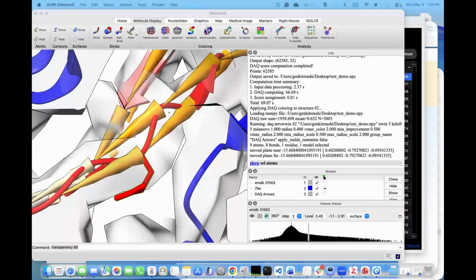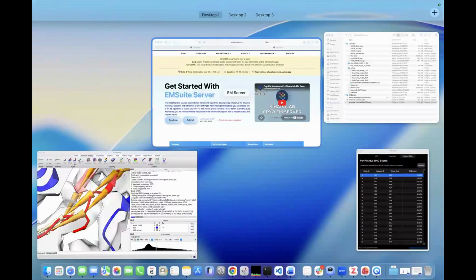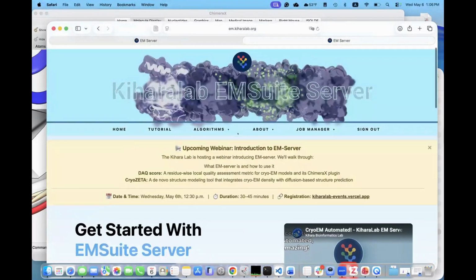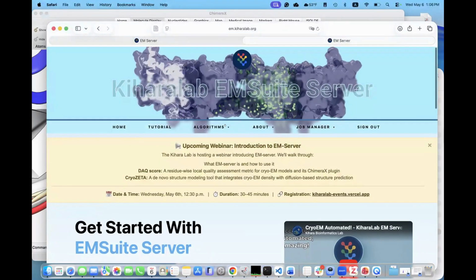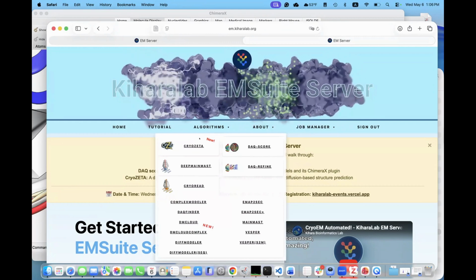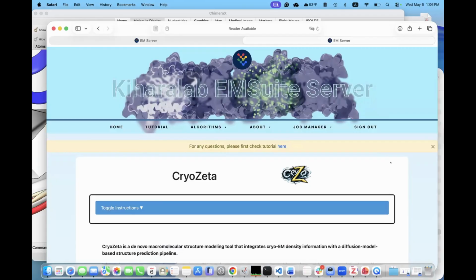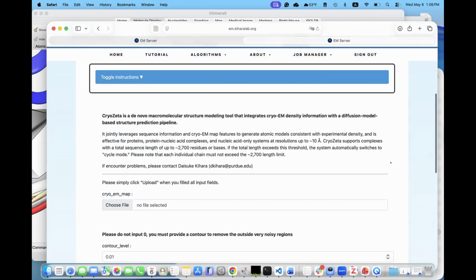Okay, then I'll demonstrate how to submit a job. So this is our EM server website. Then click here, Algorithm, then CryoZeta. This is the job submission page.